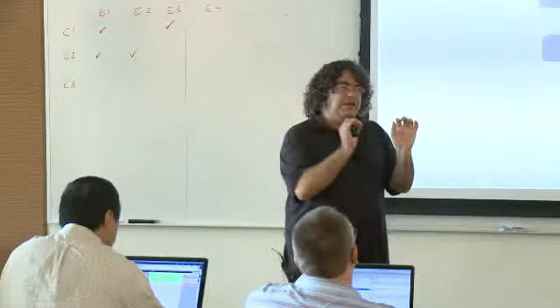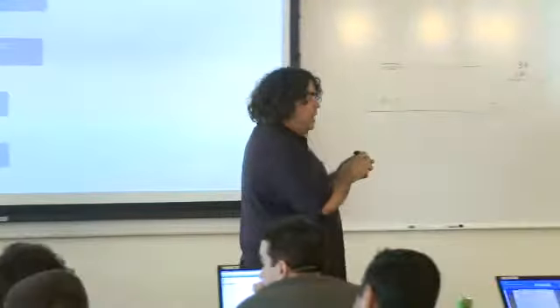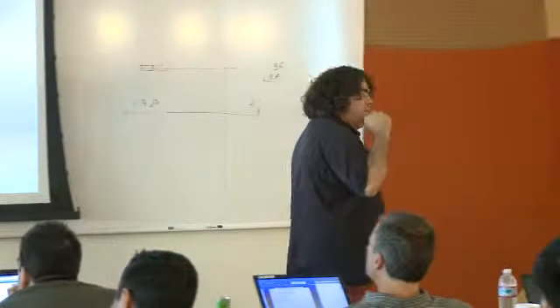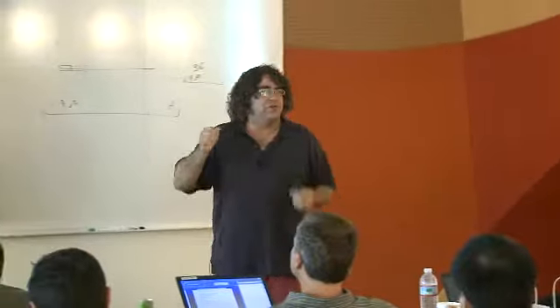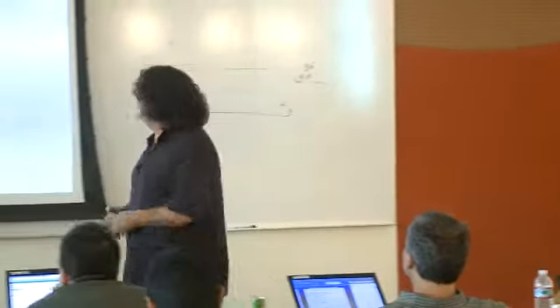And if you find enriched sequence motifs there, then maybe you have found the trigger, the thing that guides a certain transcription factor to all these enhancers in a particular context and turns them on.